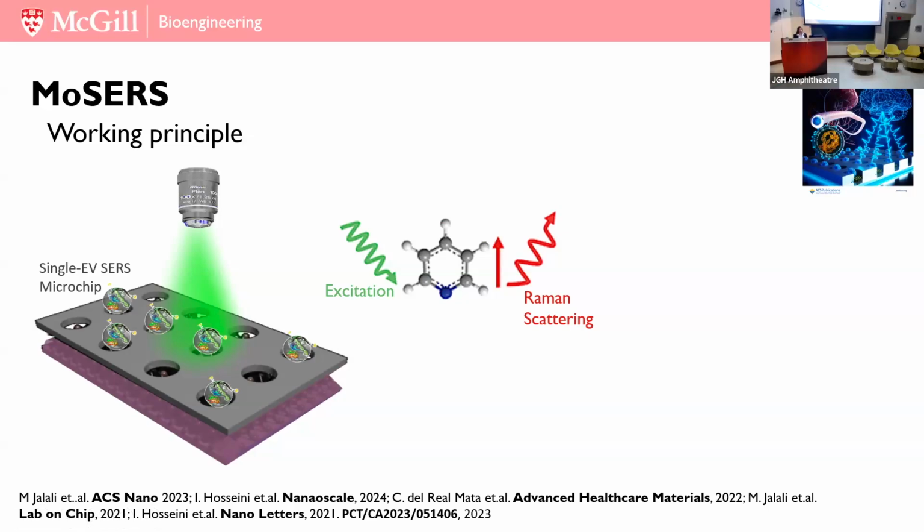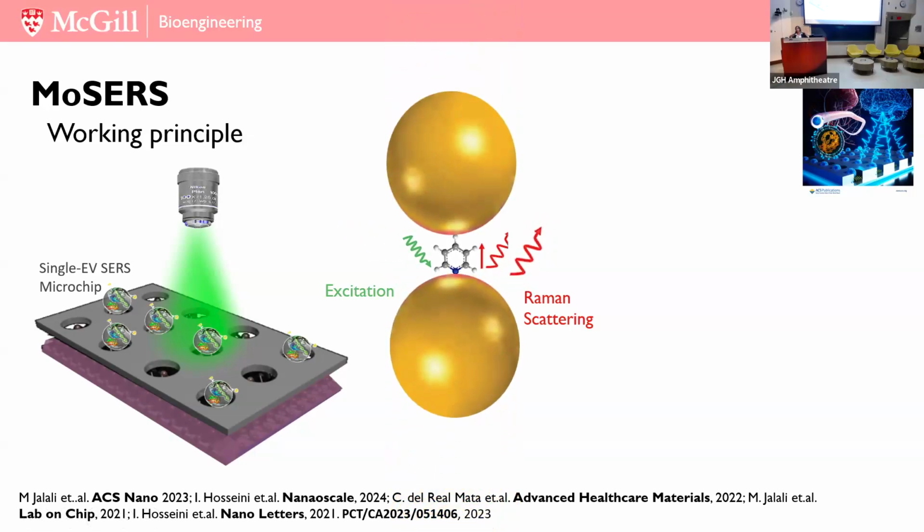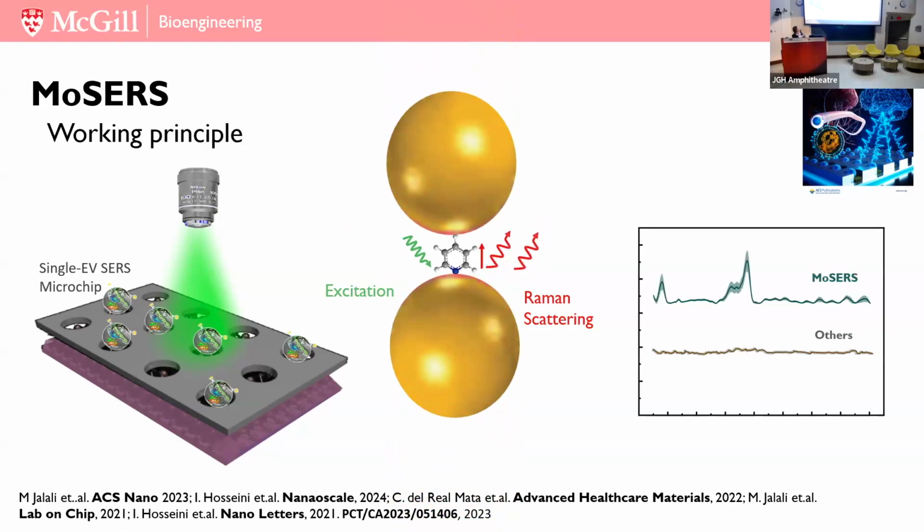Raman scattering has been around for so long. It's a method that can transfer the vibrational and structural modes of molecules and chemicals into a spectral peak. But what happens when we use nanomaterials? Because of the magic of the material and its enhanced properties, we can magnify these scatters.